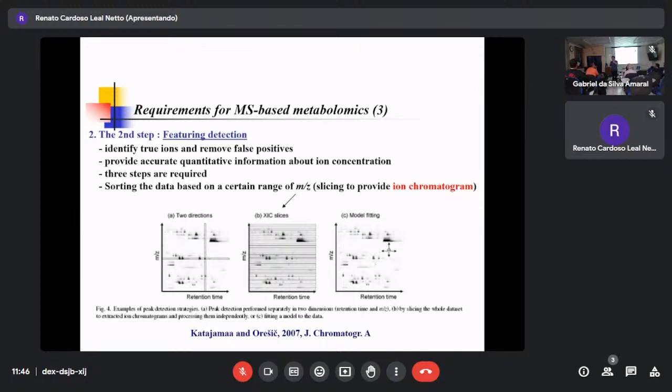Always some ghost signal comes out which is not from the sample. Strange, but interestingly, this appears only when you measure at 10 o'clock or 9 o'clock. Strange. Osaka, Japan. Do you know what's the reason?